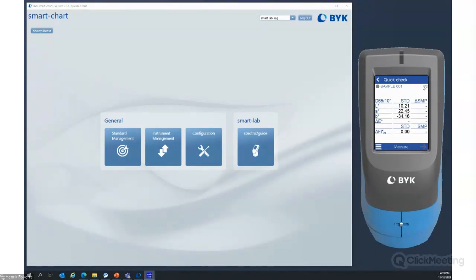You see the software setting is 3 measurements on the sample. Again, I measure 1, 2, 3, and you come to deltas. You come to the results you normally want to see. You want to see the delta E, and you want to see the delta L, A, and B. And this offers more. You can slide the screen here and you see the LAB plot.